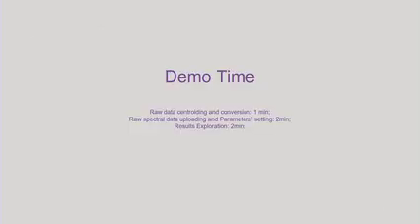So here I'm going to do a quick demo on how to do the raw data centroiding and conversion. I will also do raw spectral data uploading and parameter setting, and a quick demo on the result exploration from MetaboAnalyst. Everybody, if you have a laptop, you can find some raw data from the GitHub we have shared with you.